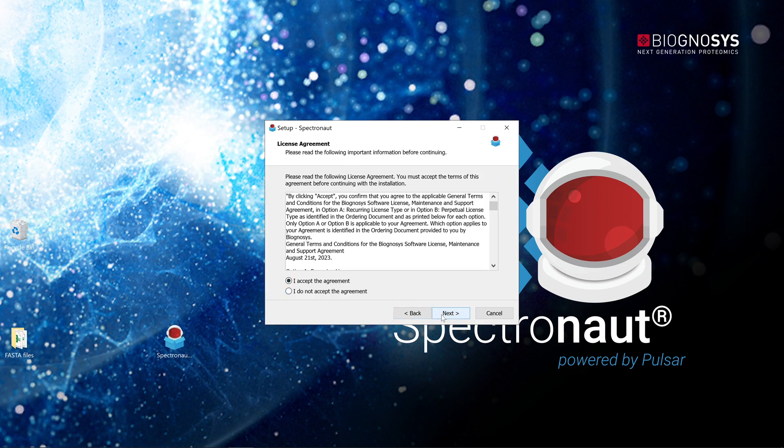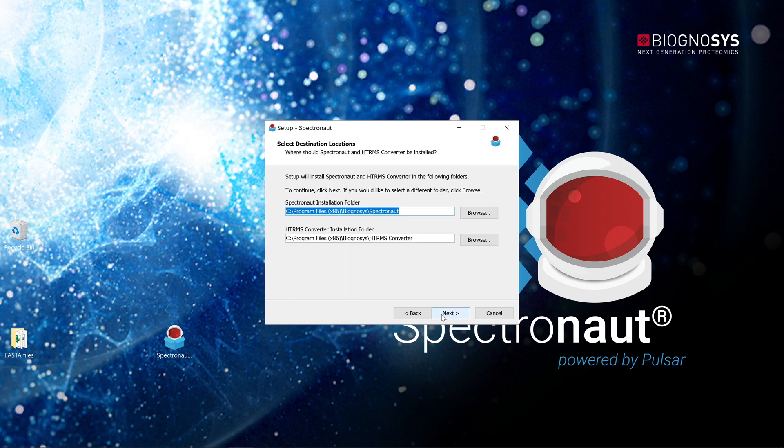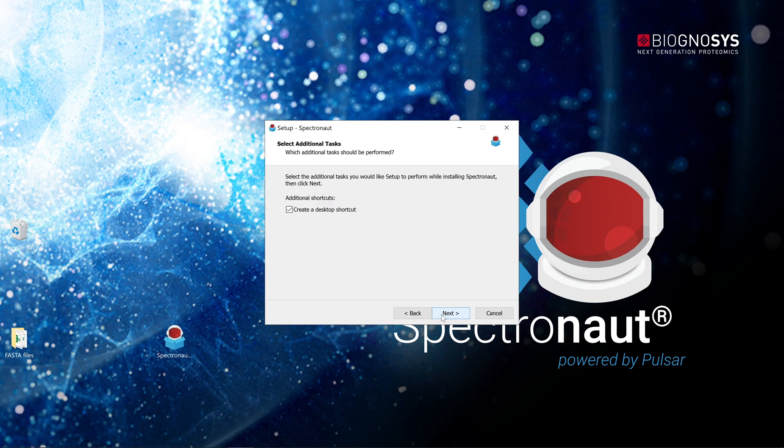The software license agreement should be accepted by the licensee. For convenience, generate a desktop software shortcut.